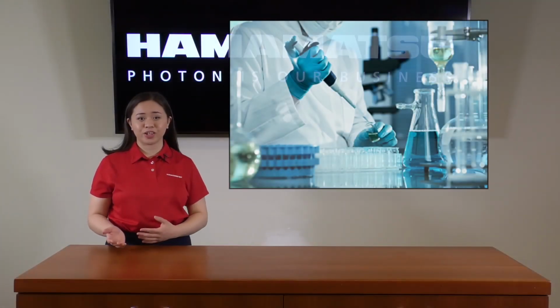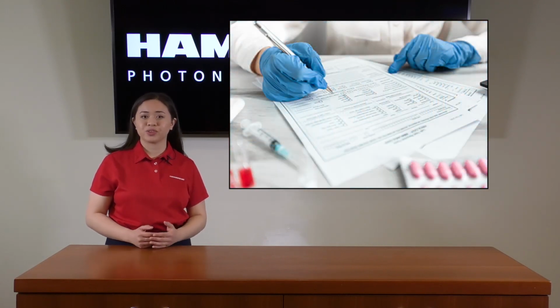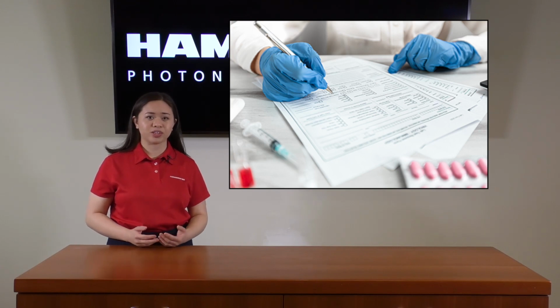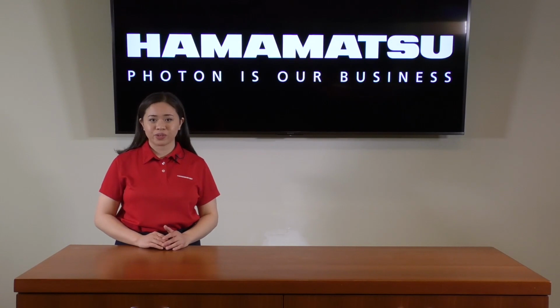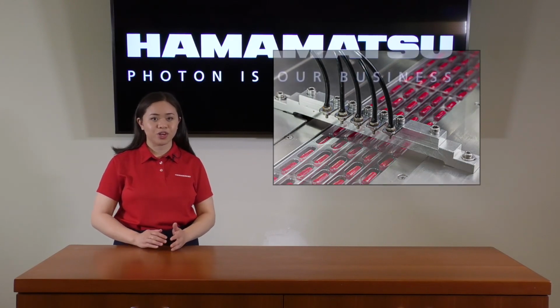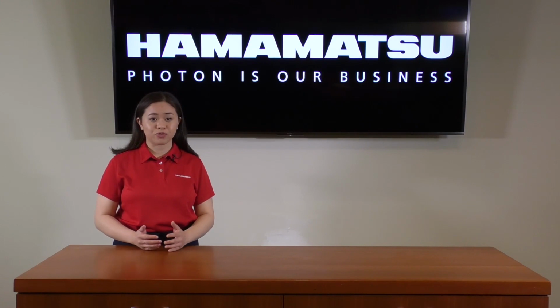From research and development to process control and quality inspection, the information obtained through spectroscopic measurements contributes to unearthing key characteristics about medicines that can be used to track consistency in manufactured products or monitor for any errors. For applications focused on inline monitoring and process control, Hamamatsu has developed various compact spectrometer options which, when combined with a light source and sample handling, are capable of approaching performance capabilities similar to that of benchtop instruments.